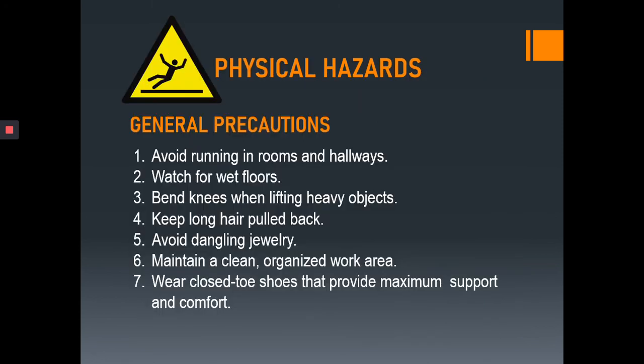Okay, then we have physical hazards, general precaution. Avoid running in rooms and hallways. Watch for wet floors. Bend knees when lifting heavy objects. Keep long hair pulled back, especially for girls with long hair. You have to tie your hair. Avoid dangling jewelry. Maintain a clean, organized work area, and wear closed-toe shoes that provide maximum support and comfort.